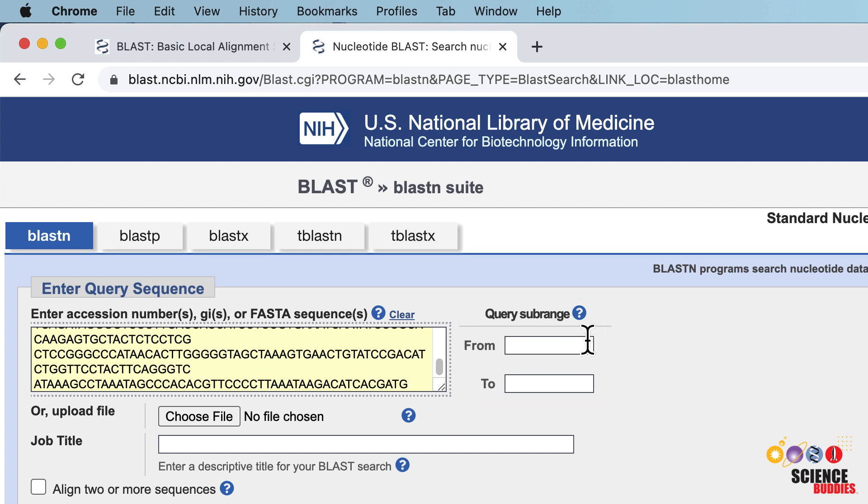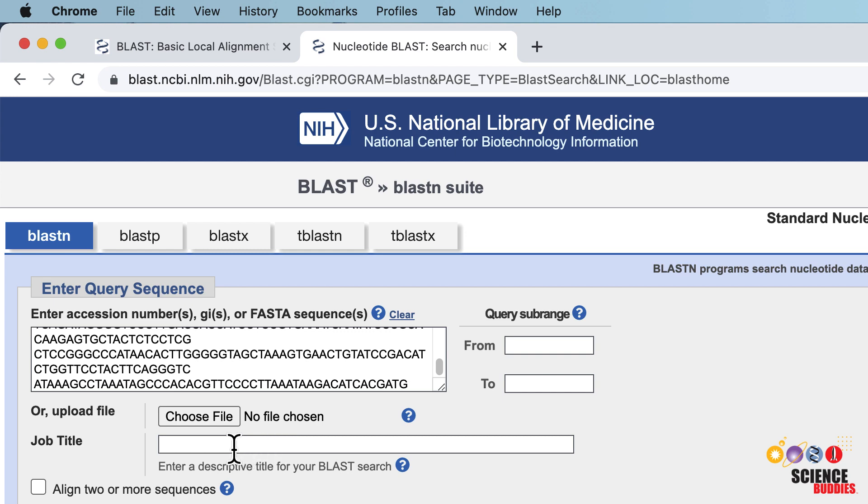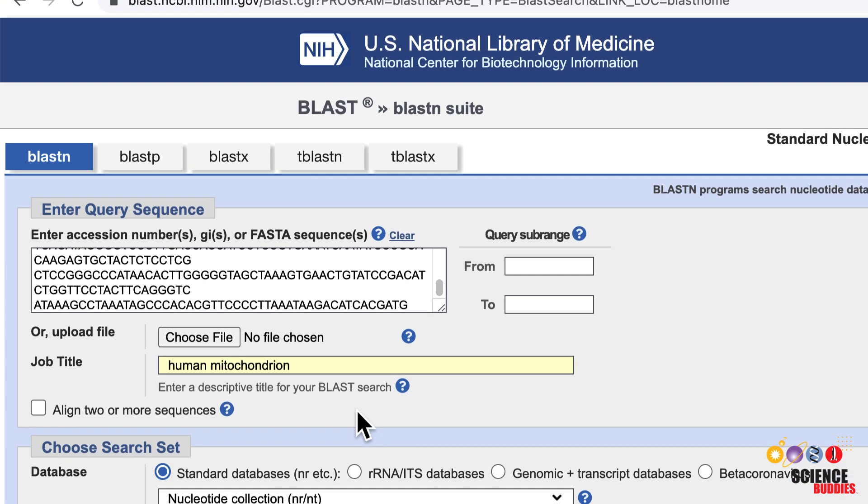Next to the search box, you have the option to limit your sequence search to only part of the sequence. For example, entering from 1 to 300 in the query sub-range boxes limits the sequence search to the first 300 nucleotides or amino acids of your DNA sequence or protein. You can name your search in the job title box underneath the search box.